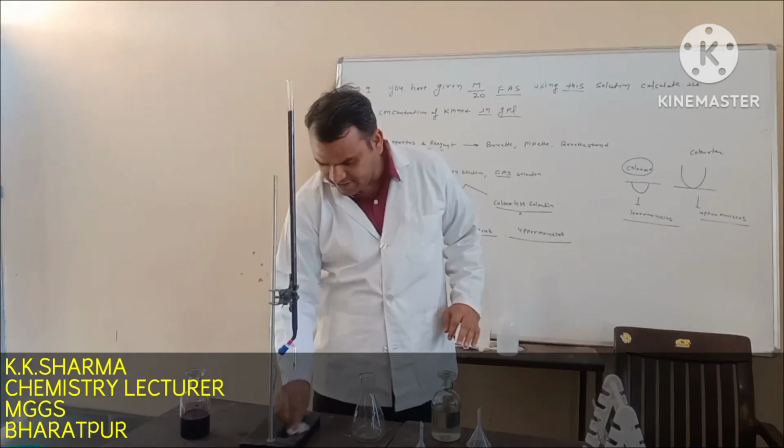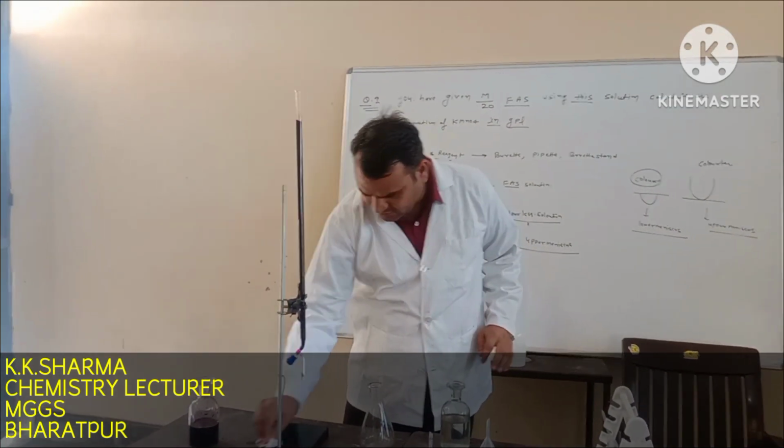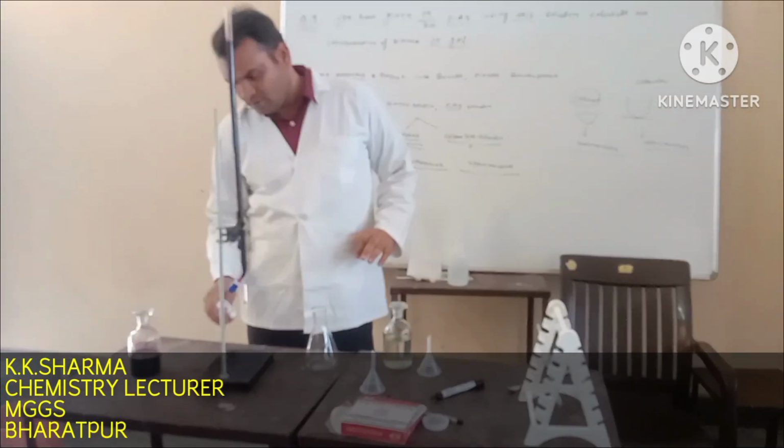If the solution is spilled, please clean it as soon as possible because it always affects our accuracy.